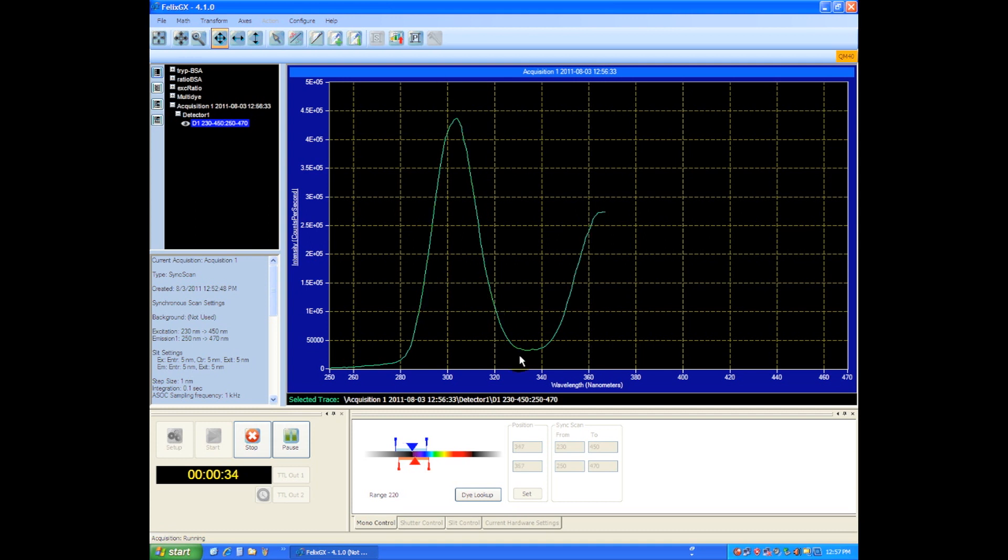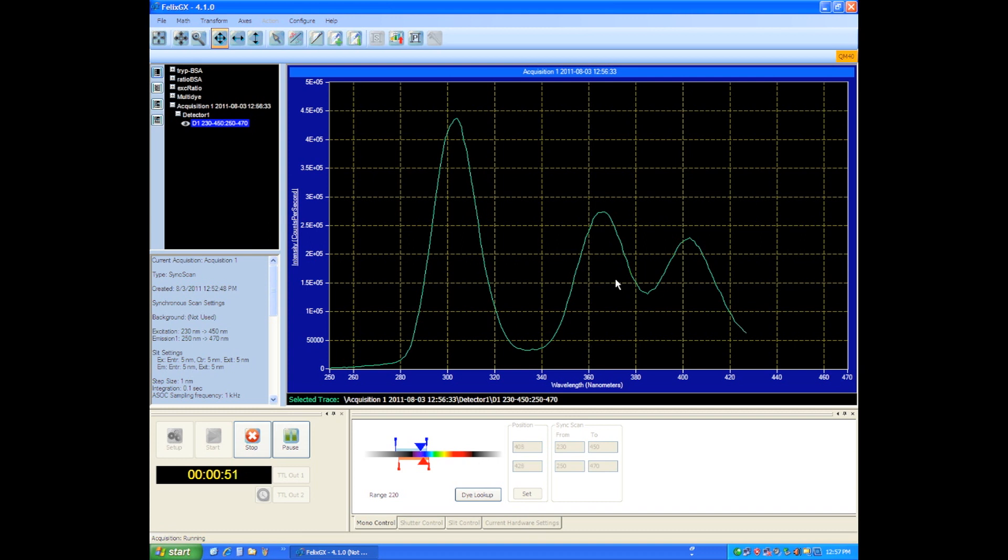Now as we approach the emission wavelength, because we're still exciting 20 nanometers before, we see another energy change. There's a third energy change around 400 or so; I'm not quite sure what that's related to, maybe some other fluorescent substance in the sample.